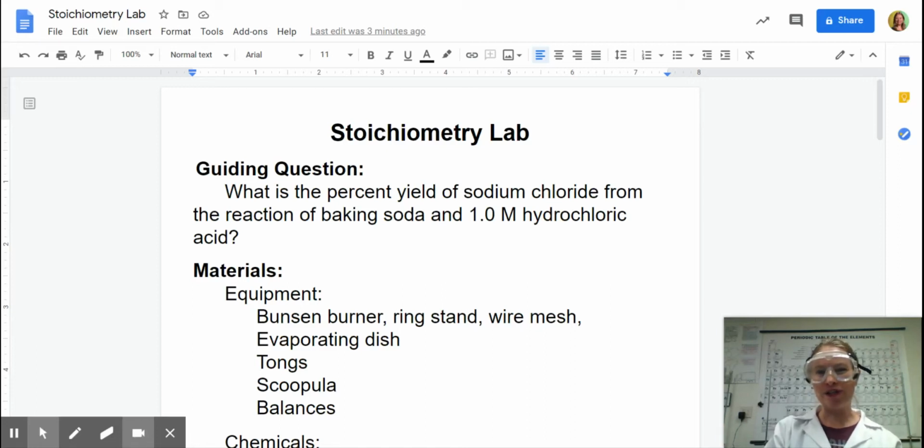Hi there, we're going to do the Stoichiometry Lab today. Our guiding question is, what is the percent yield of sodium chloride from the reaction of baking soda and 1 molar hydrochloric acid?